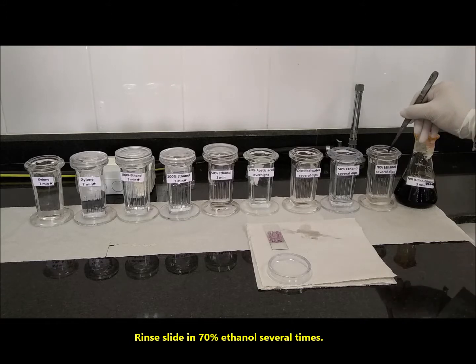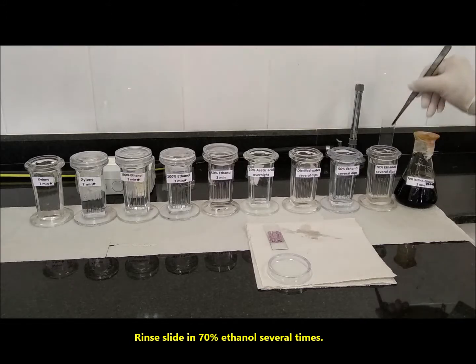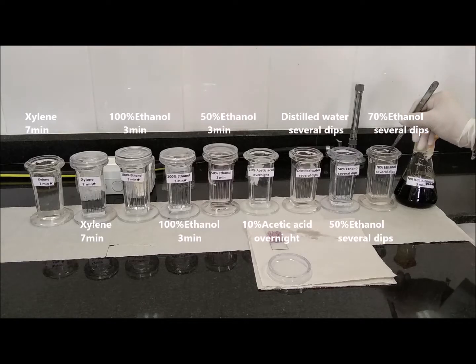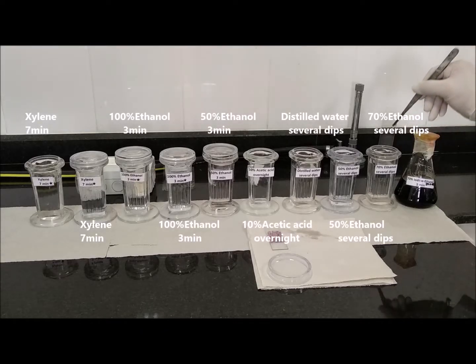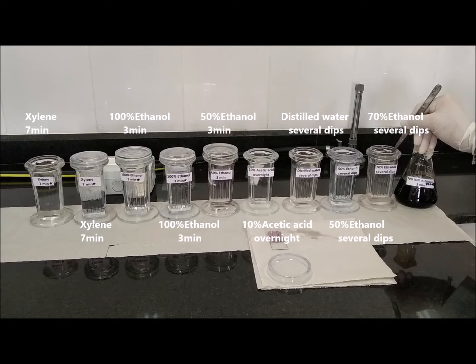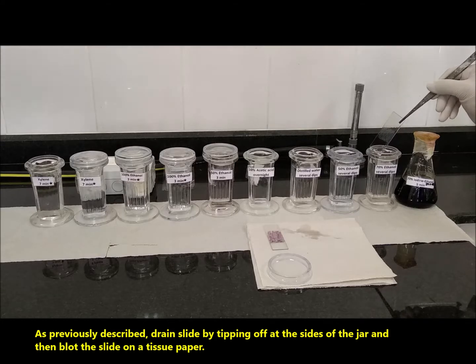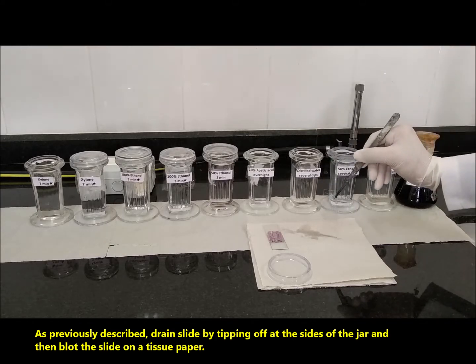Rinse the slide in 70% ethanol several times. As previously described, drain the slide by tipping off at the sides of the jar, and then blot the slide on a tissue paper.